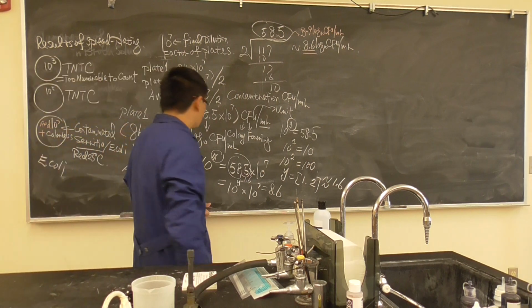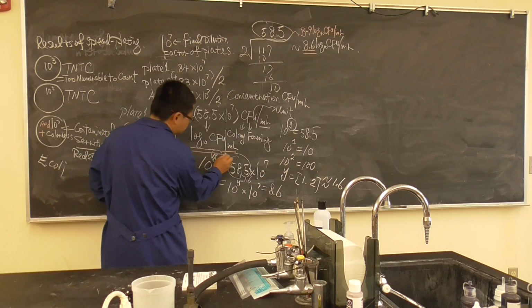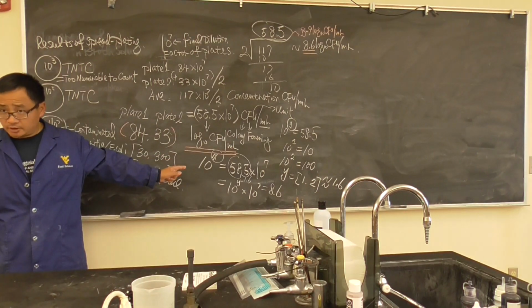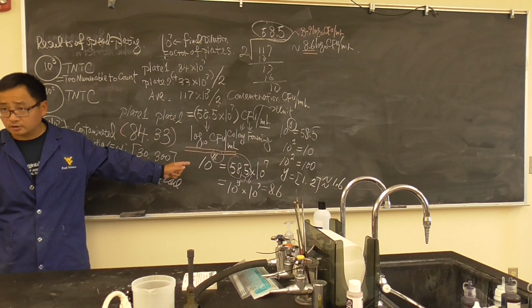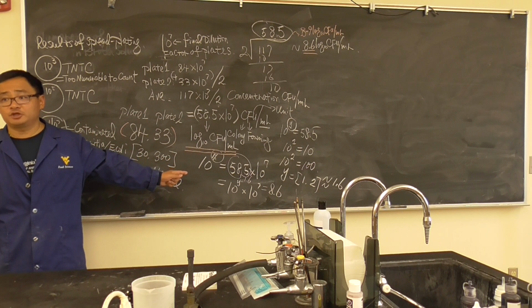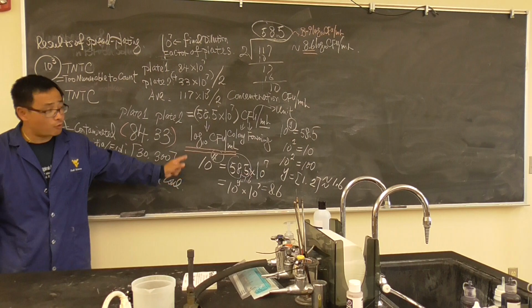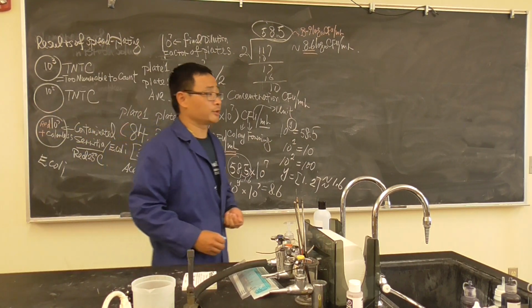So here is the question. Why do we want to make it too complicated? Is that right? There is some debate in my area, in the food and microbiology area. Some people don't like the log because we have a zero tolerance policy. Let's say ground beef E. coli O157:H7, we don't want any single colony there. So you can use a log, but why here do we have to use log? This is the statistics, a little bit.